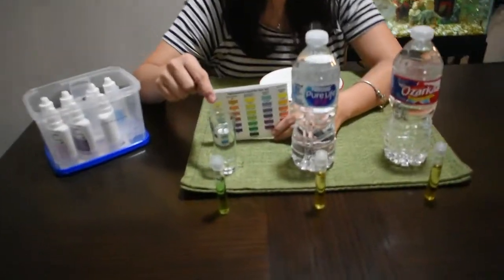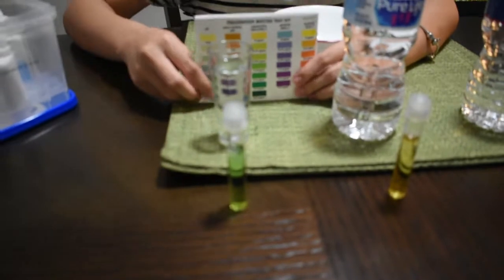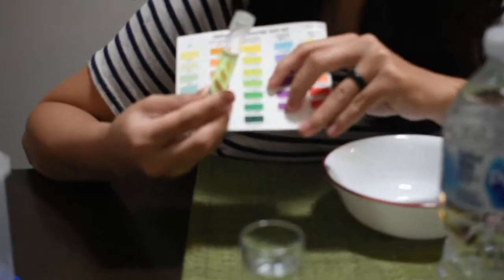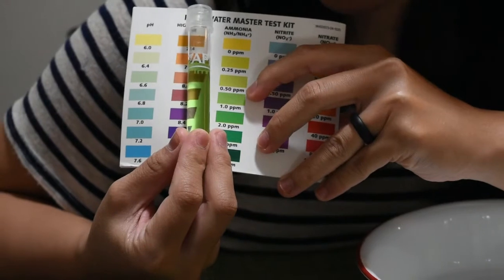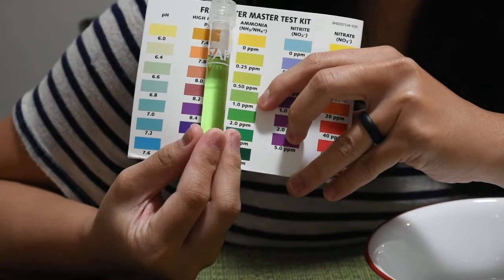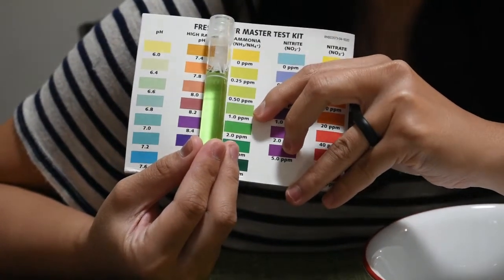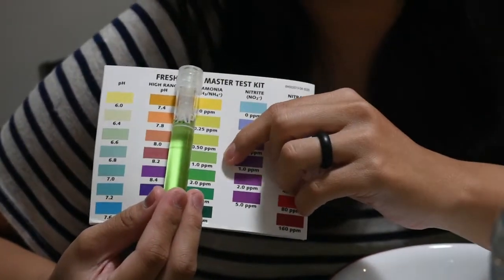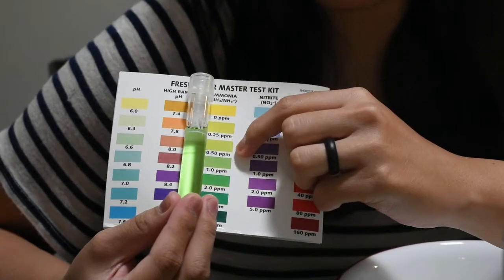Hey, so it's been 5 minutes and we will read the test result together. This is the tap water and this is the result. We'll look at the ammonia in here, the middle part. It looks like it's close to 1.0 ppm. So our tap water has ammonia in it. It's not really bad, but it still has ammonia right in the middle of it, at least around here.